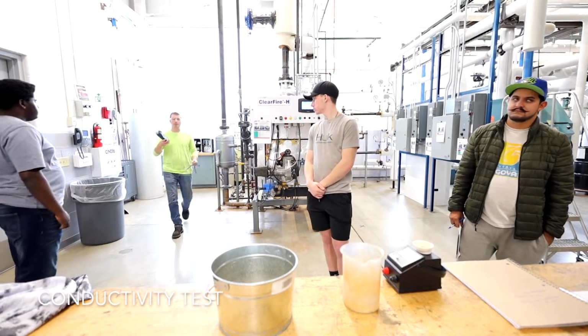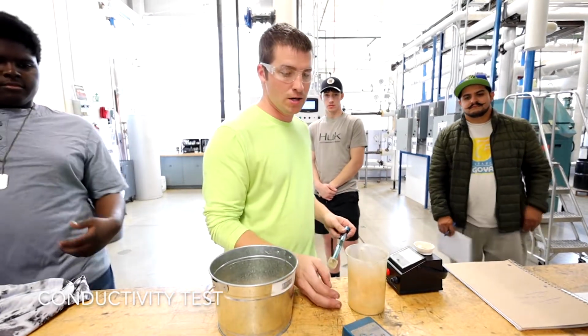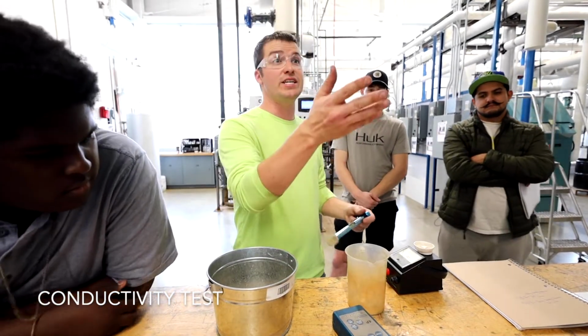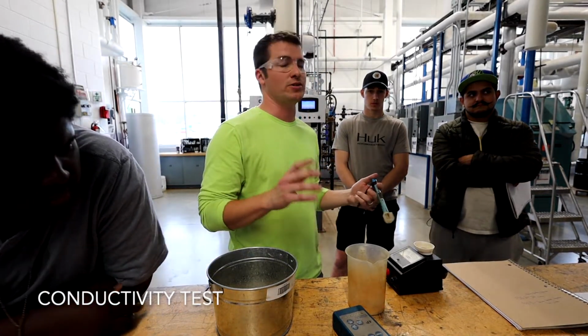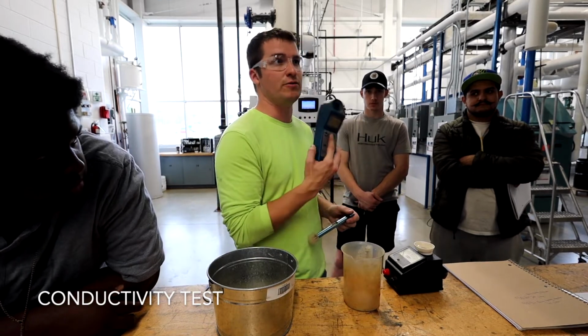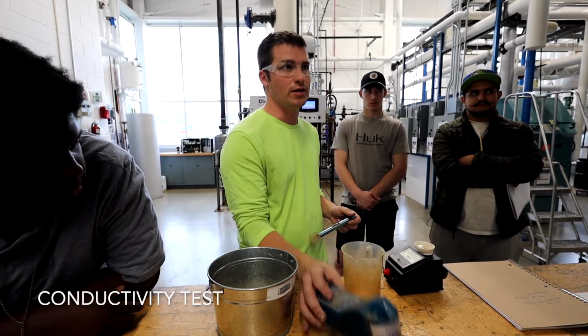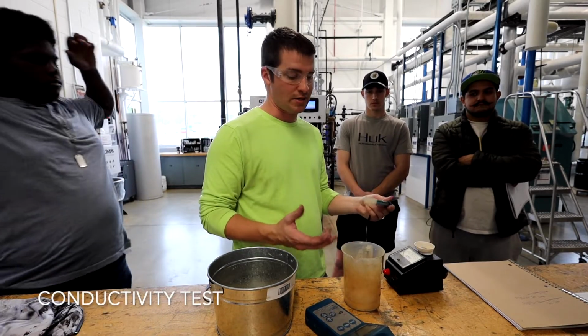Right, so I obviously have a little bit nicer of a meter because, well, I do it a lot. So this is digital, TDS is, conductivity is a measurement of TDS. They technically are different readings, but yes, for the person. So like mine can do conductivity, resistivity, and TDS, right? This one is only gonna spit out the conductivity, but we're controlling in conductivity, so that works.